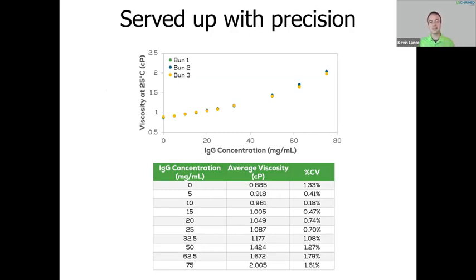I really like this data because it's the kind of thing where you can actually get precision data at all these different concentrations, where this would take lots and lots of time when run on old school instruments if you're doing this one at a time.